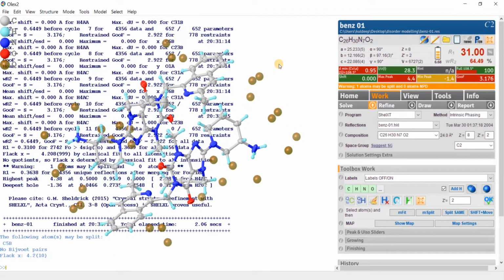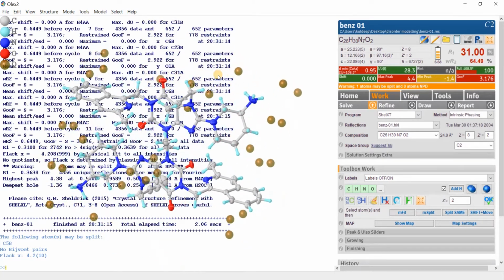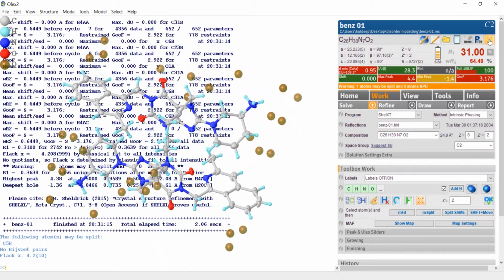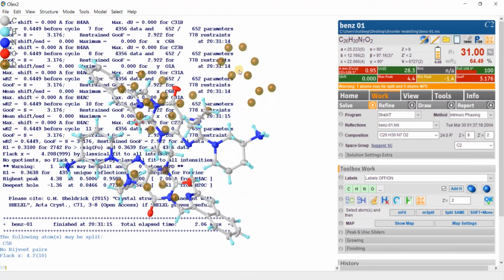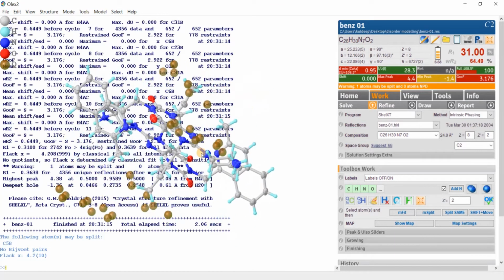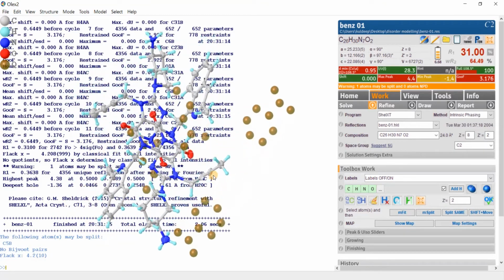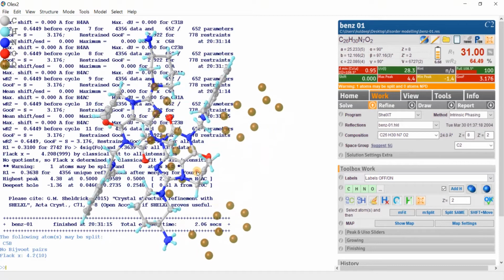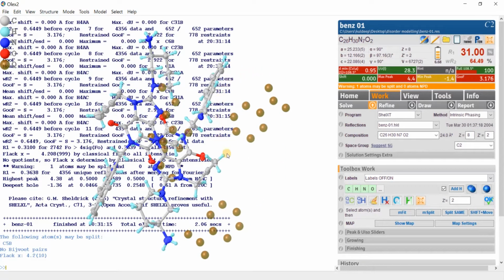From a crystallization point of view, we are expecting some benzoic acid or some benzoate molecule in the crystal lattice. So for this, I am going to press this button compact and I am getting one benzoate here and one benzoate here. These two benzoates are looking very clear in the crystal lattice. So okay, let's model these molecules first.